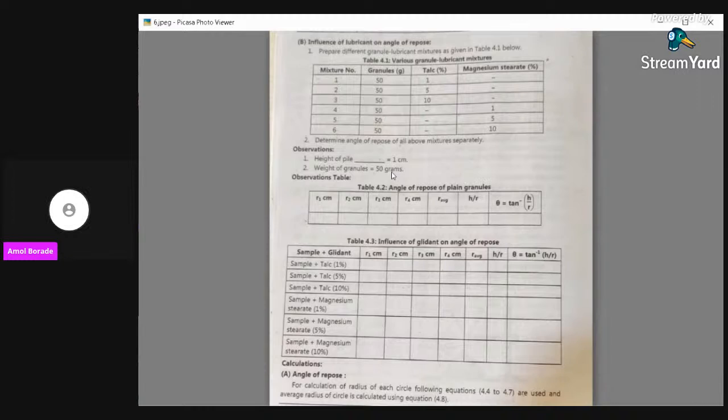So simple. I guess you have understood this procedure. What we have now is 7 circles, and the height also. 7 circles are there, 7 different diameters of different batches are there. You have to find out the diameter of each batch, and when you divide the diameter of each batch by 2, you will get the radius of each circle.